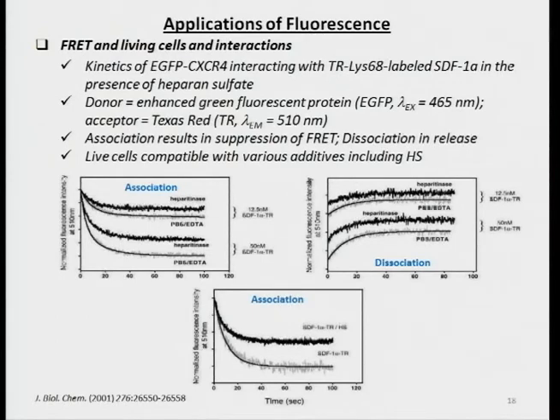But when you put in heparinase, this is in cells. So this is basically monitoring in cells. That's the main advantage of choosing these fluorophores, because you are moving it away from the normal stuff that is floating around. So heparinase should actually cleave heparan sulfate. So it should chop it down, and if heparan sulfate was contributing, then you would dramatically change the kinetics of association.